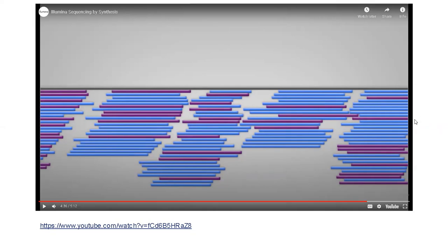No doubts. Okay. One more point to note is that with the addition of each nucleotide, a fluorescence was emitted when that particular nucleotide was added. This fluorescence is noted down by a camera, and that is what you were seeing in one of the visuals, where a lot of colorful spots were coming up when you look from the transverse section.